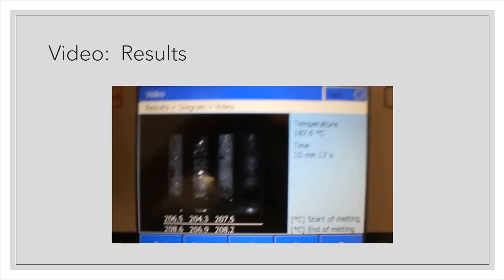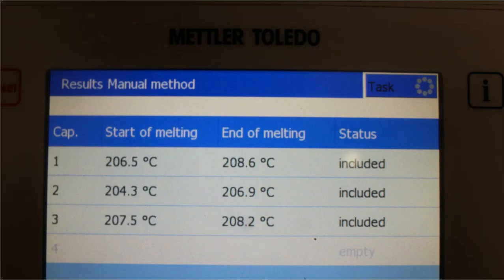All right, folks, so the very last slide that I have for you with this lab experiment is the temperatures. So here they are. So in case you didn't get them down, here's a screen that you can pause and maybe write them down. Three separate samples were analyzed. A melting and an end temperature was provided with each one of these. In the lab directions, though, you're going to probably have to use an average. And this is how we do this, all right?